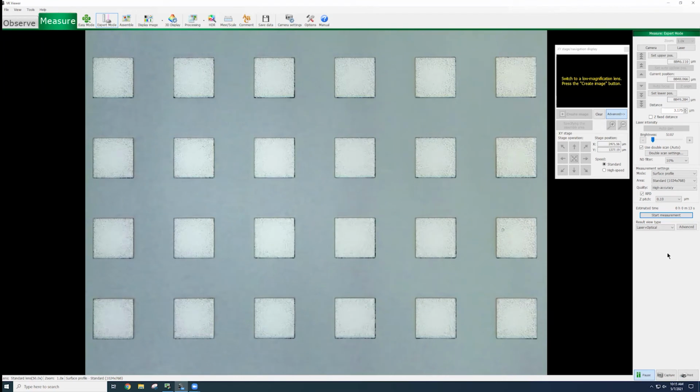On this particular piece of equipment, can you drive to specific wafer coordinates or sample coordinates if you knew, like on an XY plane, that you had a feature that you wanted to review? Could you type those coordinates in, or do you drive to it manually? You drive to it, you can't type them in. If you're looking at the stage position window here, it does give you the XY coordinates, but you can't manually input them.